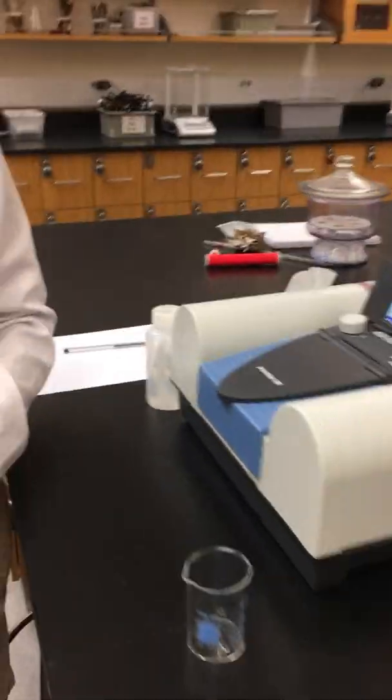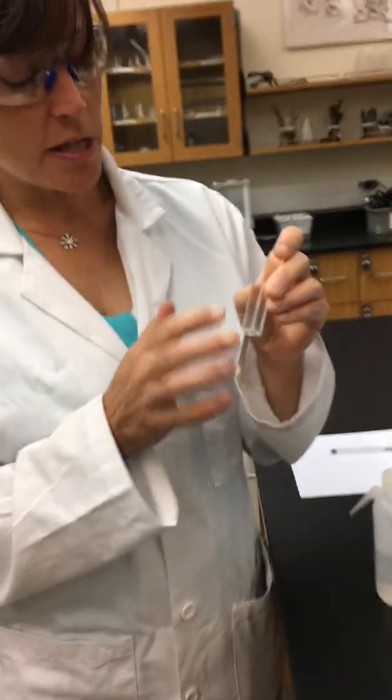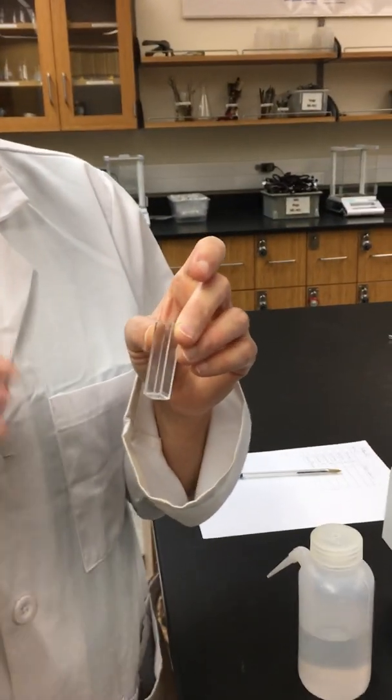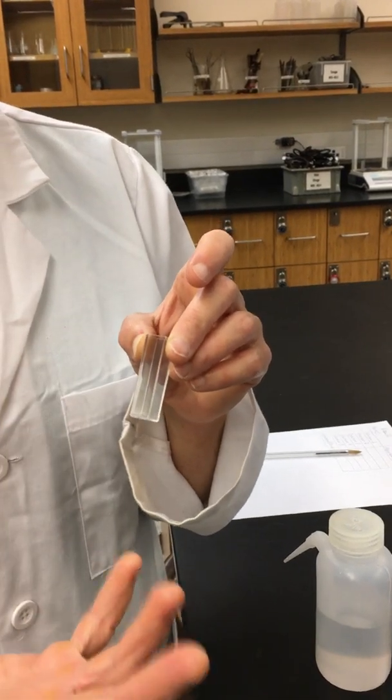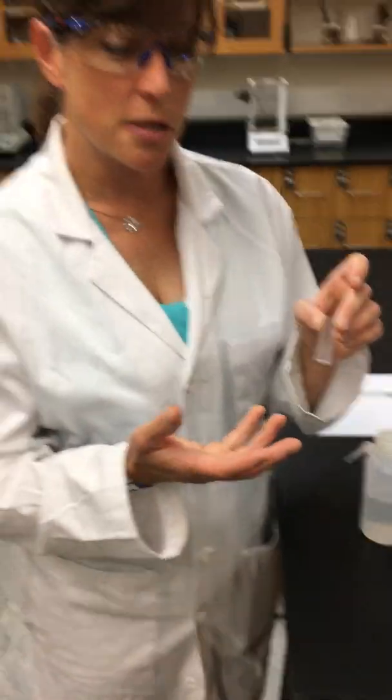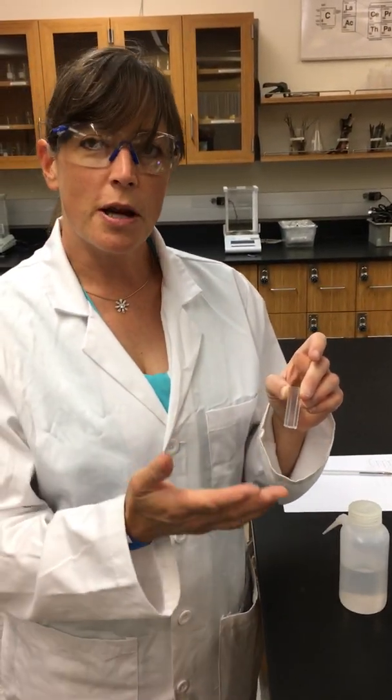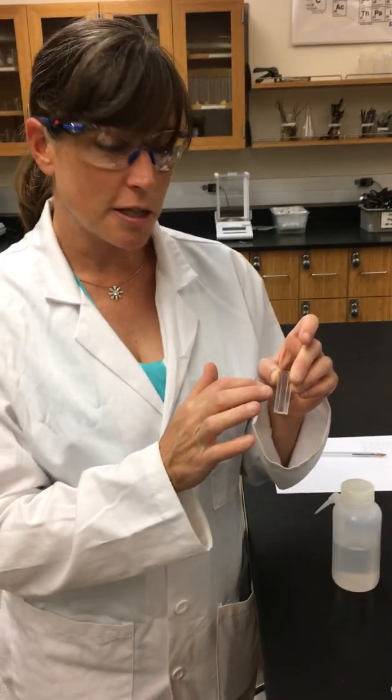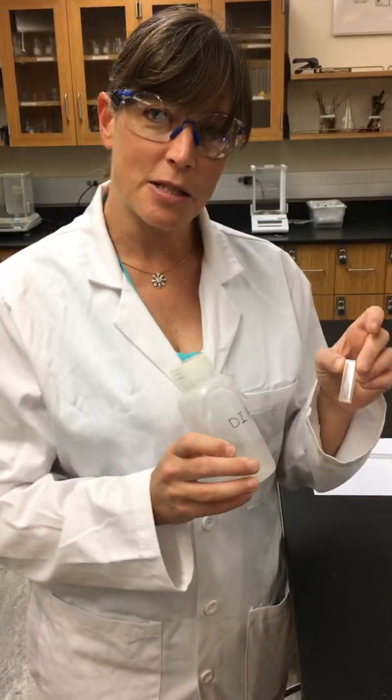Before we begin by measuring the absorbance, we have to do what's called blanking. What I'm going to do is we have what's called a cuvette. The cuvette is what we're going to fill our sample with and this is where the light is going to pass through the sample to measure the absorbance of that material. We want to make sure we're only measuring the absorbance of the actual FD&C blue dye number one, so we want to subtract away any absorbance that the cuvette has and our solvent. In our case our solvent is deionized water.